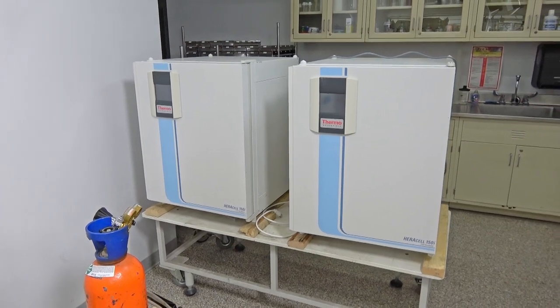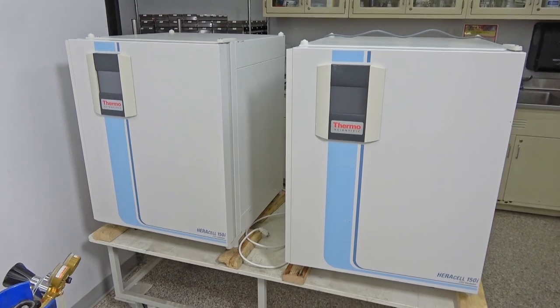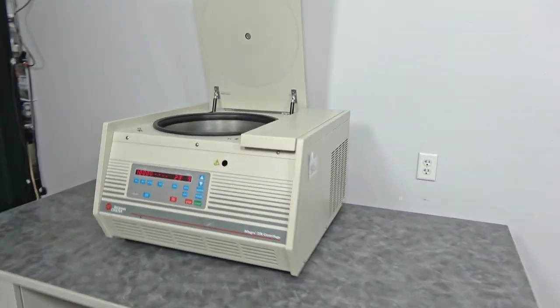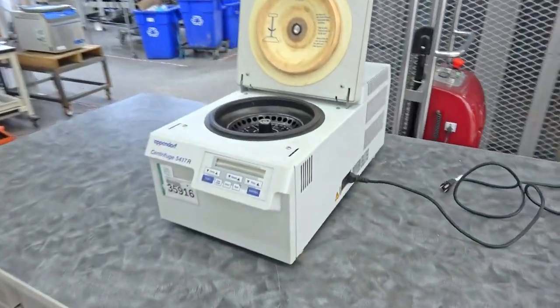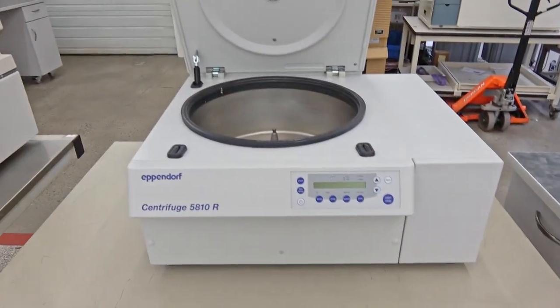Welcome to the New Life Scientific Photography Floor. We're starting with three Thermo Scientific incubators, a Beckman-Coulter Allegra 25R, an Eppendorf 5417R, and an Eppendorf 5810R.